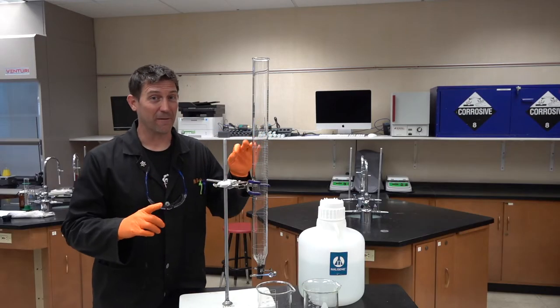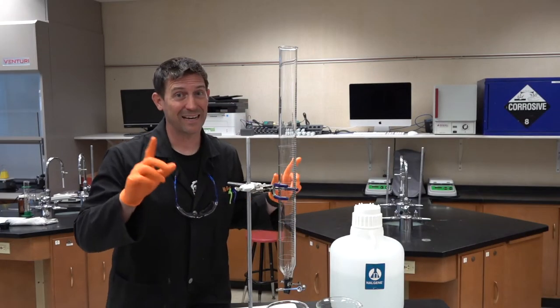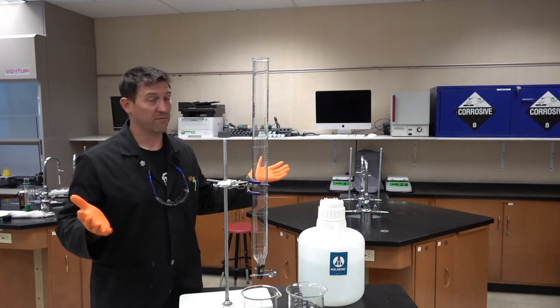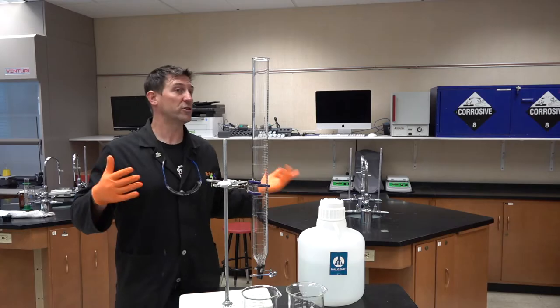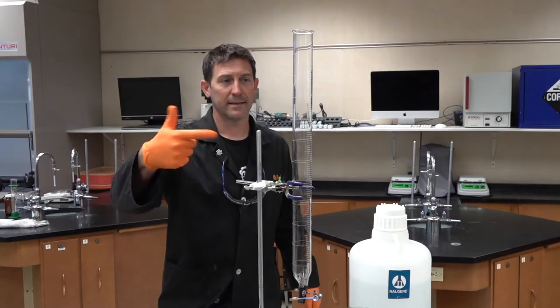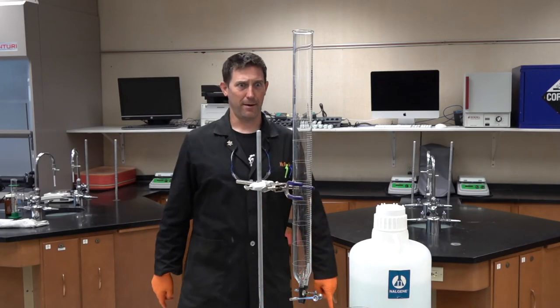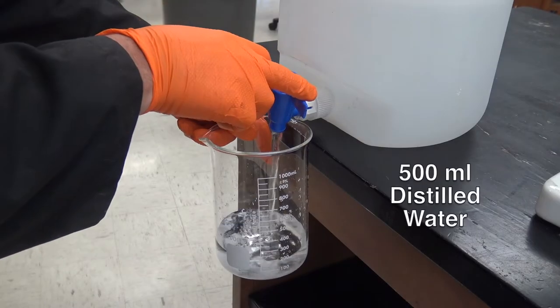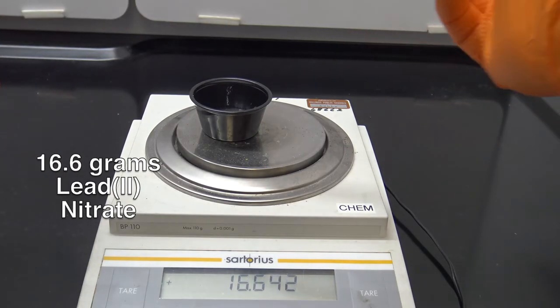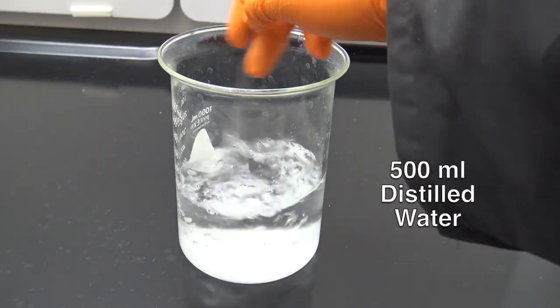That's pretty cool on a small scale, but I want to step it up a notch — go big. I kind of live by the model: if a little is good, more is better — which isn't actually a good model, especially in the science lab, but let's go way bigger. We're still gonna use 0.1 molar solutions, which means we need more of each chemical, and we're gonna use 500 milliliters of distilled water for each of them — the same reaction, just on a much larger scale.